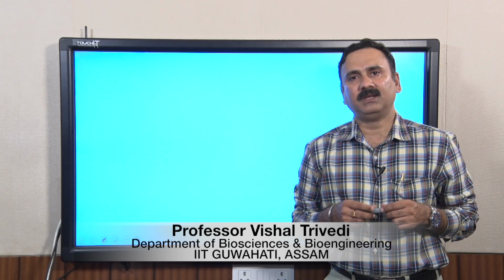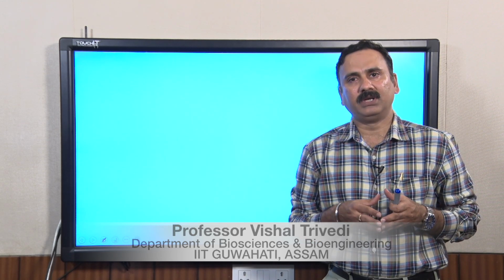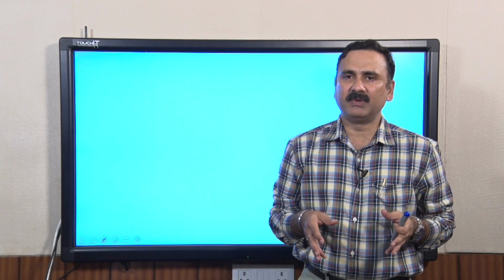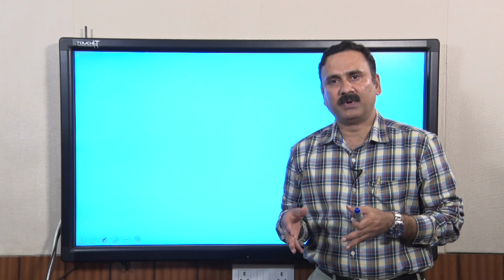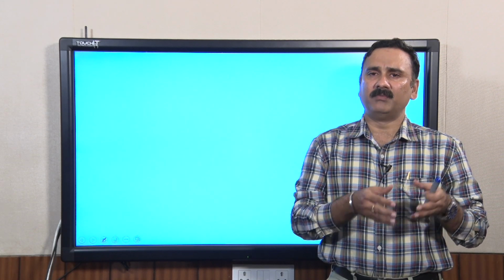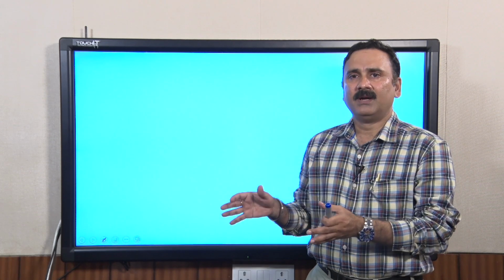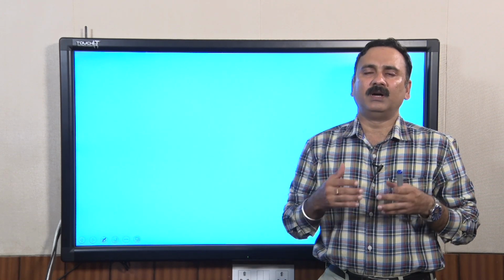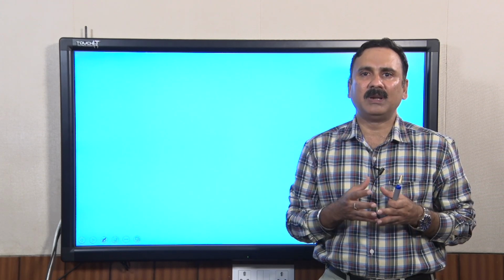And what we were discussing in the previous two lectures, we have discussed the basic principle of electrophoresis, as well as how to perform the electrophoresis. And in the previous lecture we also discussed that once you get the image, you can do a lot of analysis with the help of different types of software which are available.